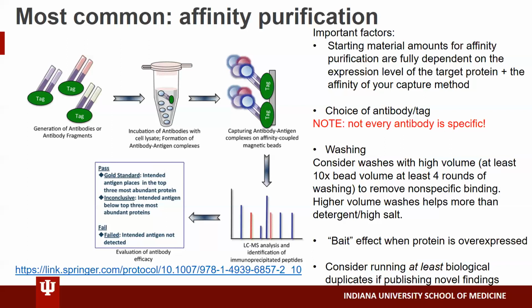By doing that, you're able to really reduce the amount of antibody that you add. It also helps to give you some idea of the affinity of the antibody in very rough terms, and that can be really helpful when you're designing your experiments. So I just want to make that comment.